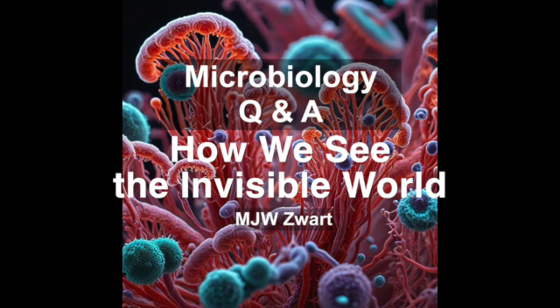So this seemingly simple color difference actually tells us something really important about the structure of these bacteria. It does. Why does that matter? Well, knowing the gram status of a bacterium helps doctors determine the appropriate antibiotic treatment. Certain antibiotics work better against gram-positive bacteria, while others are more effective against gram-negative bacteria. So this simple staining technique can have a big impact on patient care. That's incredible. Who knew that a little bit of dye could hold such crucial information?